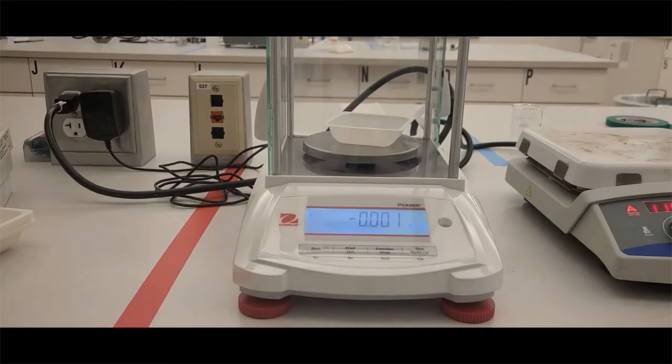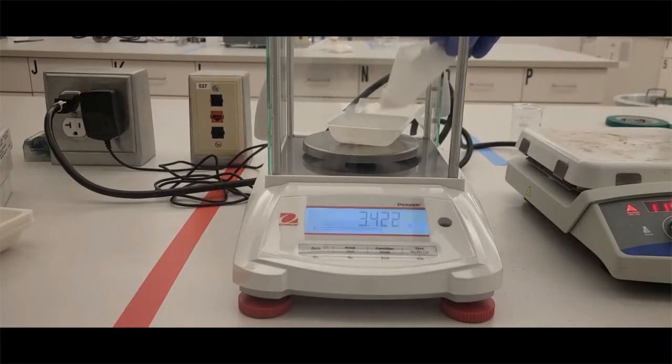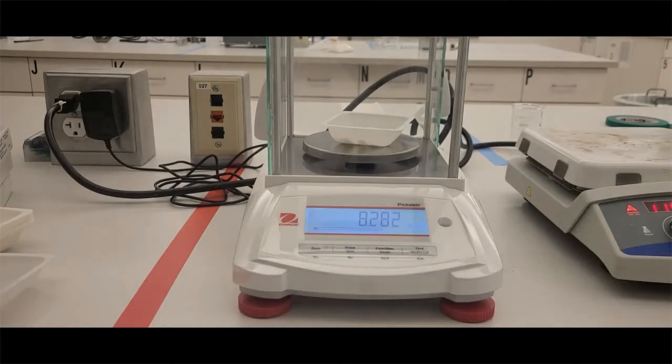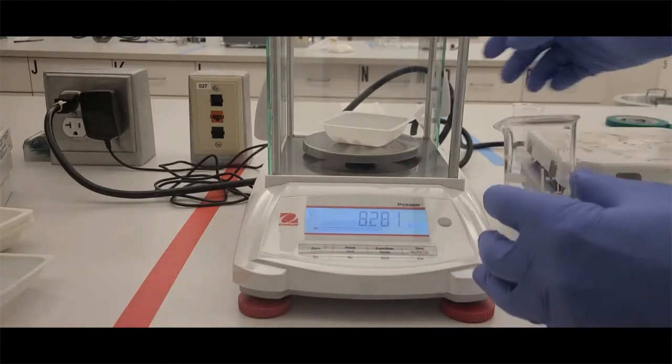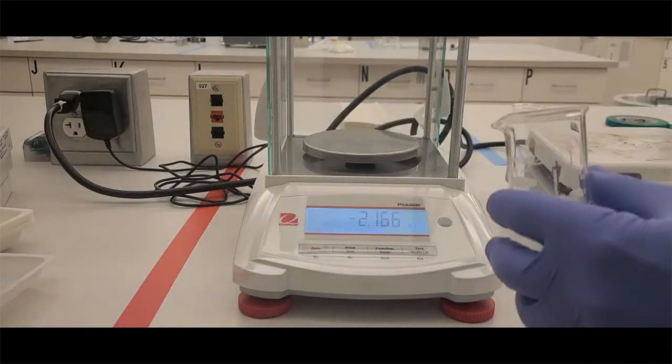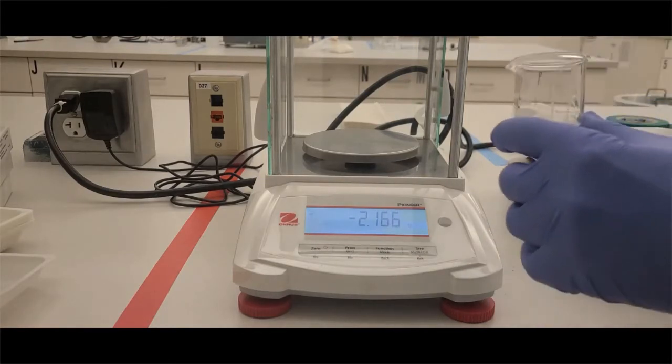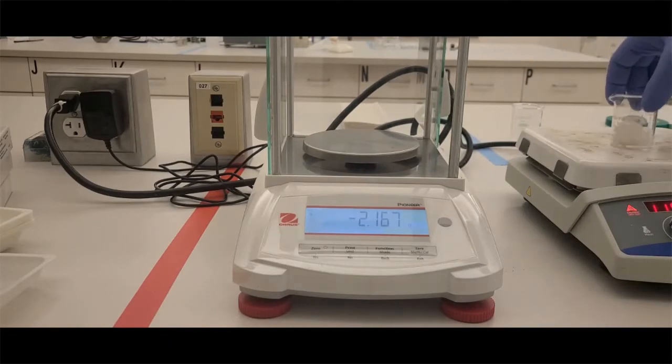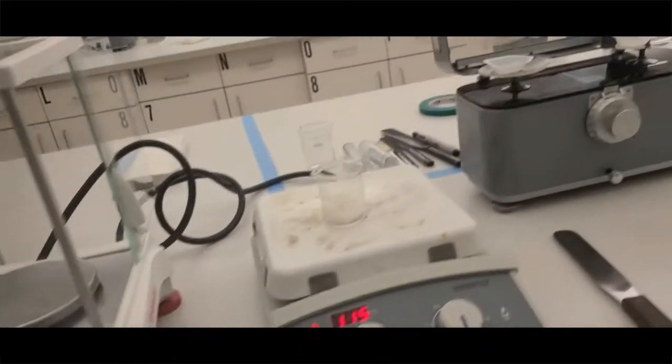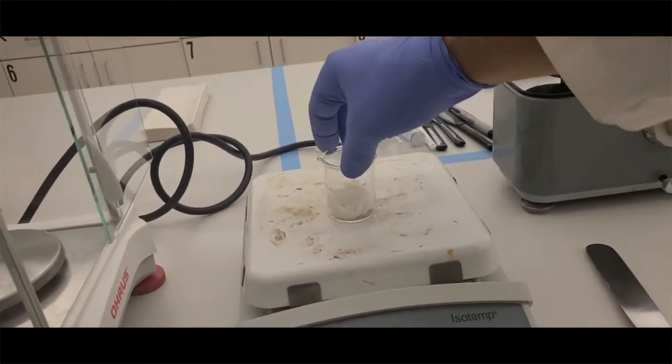Next, you're going to weigh out the amount of base we need to fill at least three suppositories. We're looking to find the blank weight of a suppository. To do that, we're going to assume about two grams per suppository. We need three plus one extra, so we're going to weigh eight grams, roughly. We're going to put it in a beaker, put it on our hot plate, and let that melt.